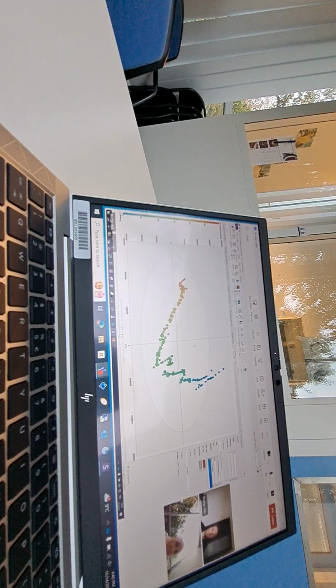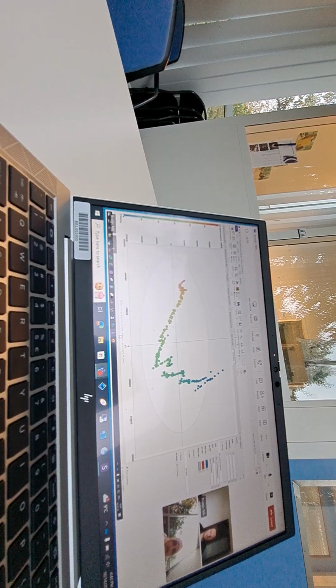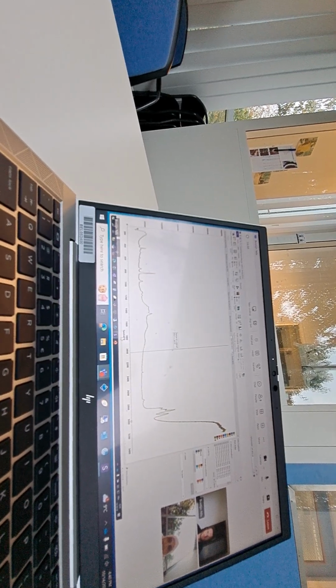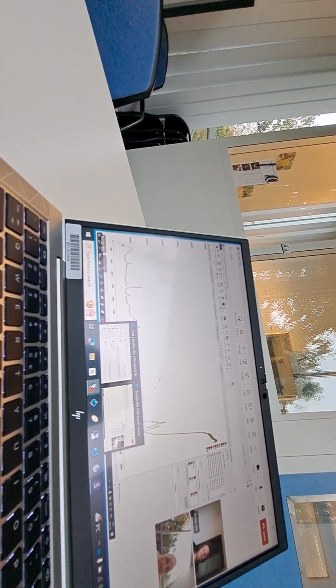It could be useful to color according to the pH as well, to see if you have a certain drop that you would see here or in the spectra also. So it's all possible. I'm just playing with these. Since morning, I just reproduced a little bit of what you showed me in the morning. Sorry, I'm asking silly questions. It's difficult. You can do a lot with it, so it's not always easy to find everything back.